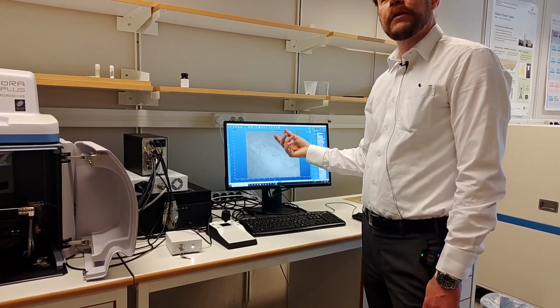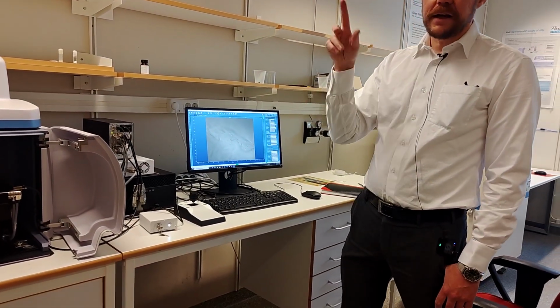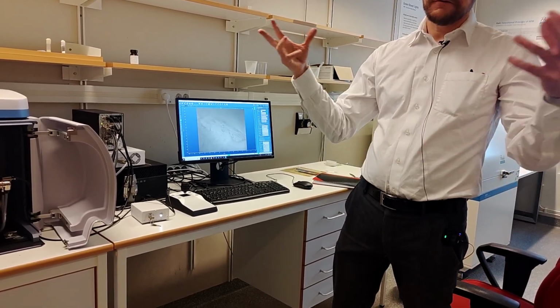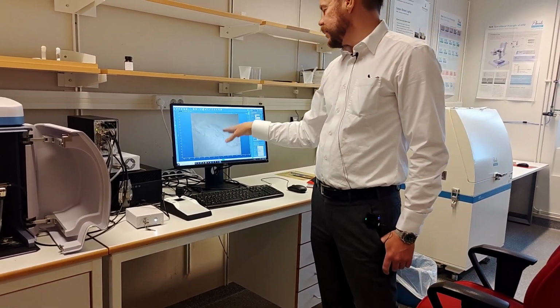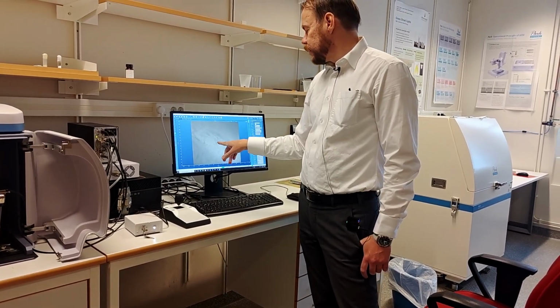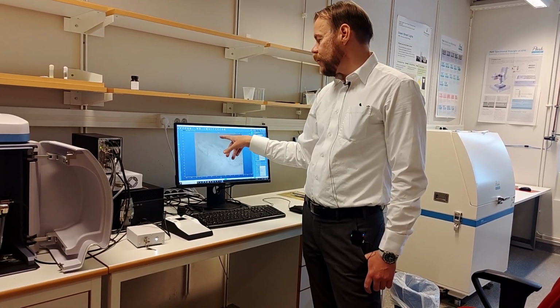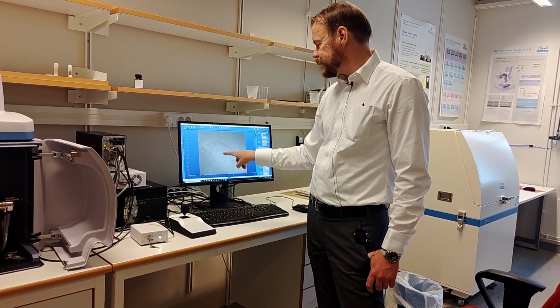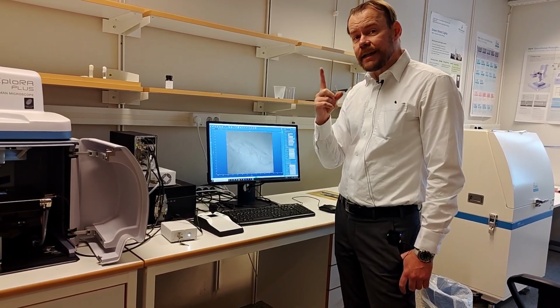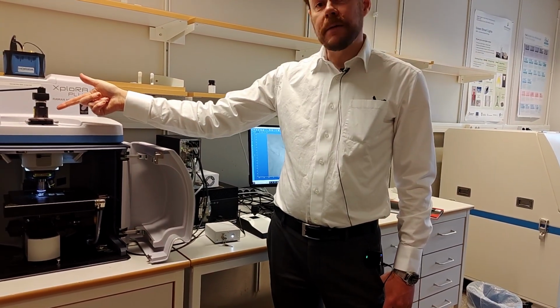Theoretically, if the material, like a crystal like this, is transparent, the laser can bounce around and scatter, and you can get information from wider areas. But this gives you some kind of feeling. One thing to take notice of is that the program assumes that the laser hits in that center. It doesn't have to be like that, because this camera can be misaligned.